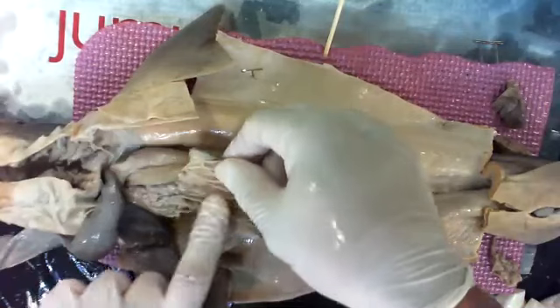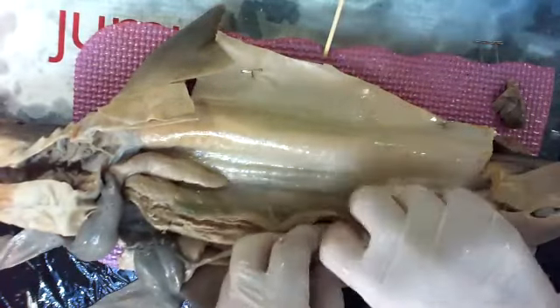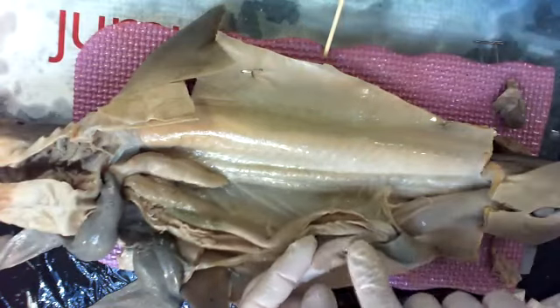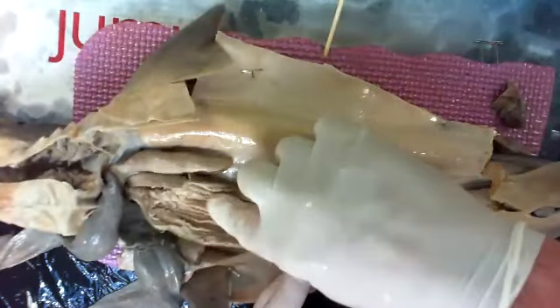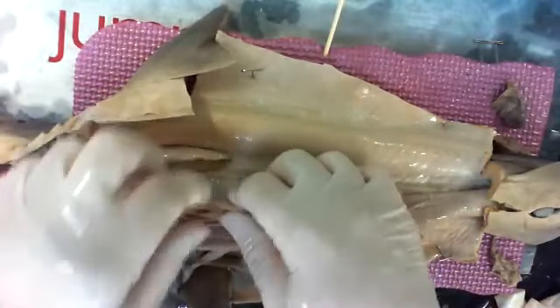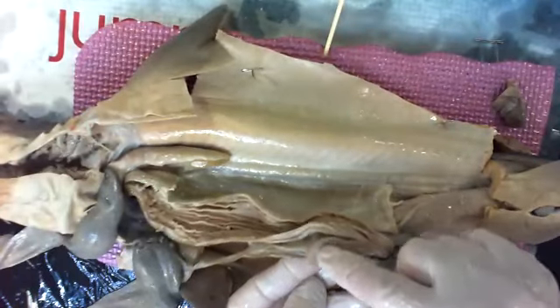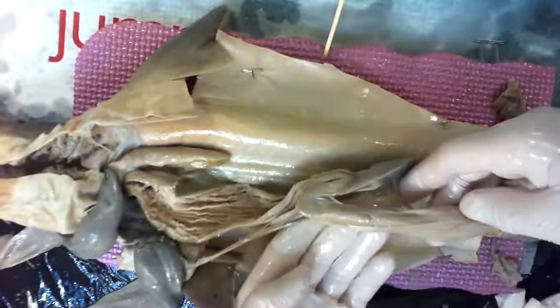So esophagus, stomach comes around to a J, and here in the J, it gets really firm, like muscle. It's because this is a muscle. It's a round muscle called a sphincter. When you eat food or when the shark eats food, the only way you can get the nutrients out of the food is if you process this down to baby food. So it smashes and purees and turns it into mush. Once it's mushy enough, this muscle opens up and lets the food go into the next section, which is the intestine. Here's the intestine.